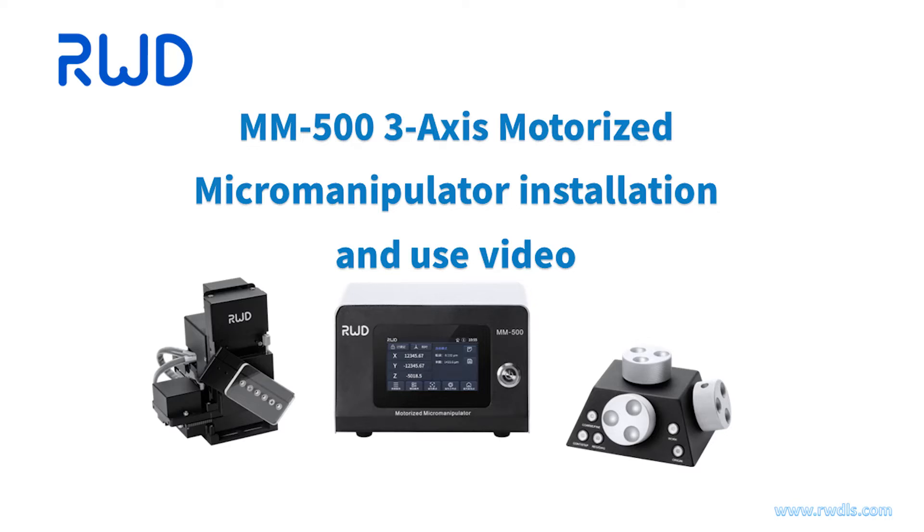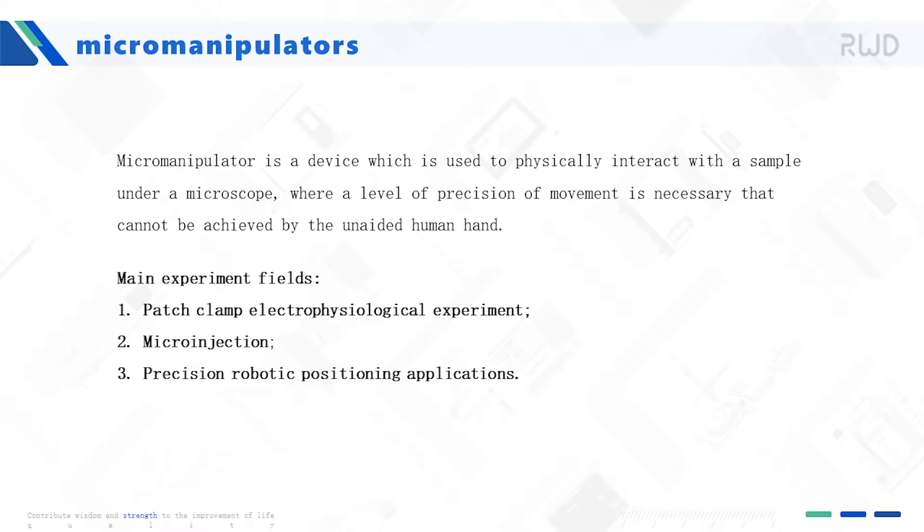MM-503AX motorized micromanipulator installation and use video. A micromanipulator is a device which is used to physically interact with a sample under a microscope where a level of precision of movement is necessary that cannot be achieved by the unaided human hand.